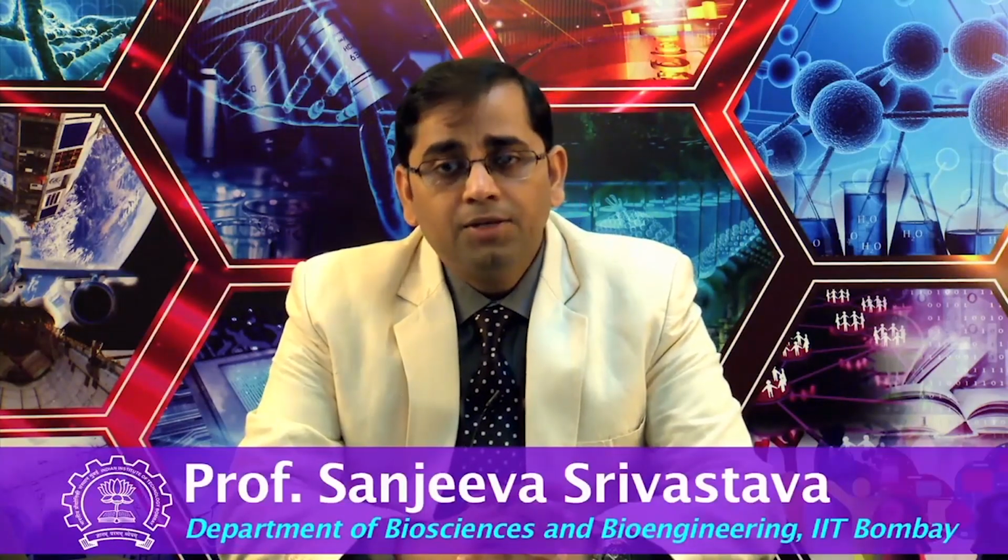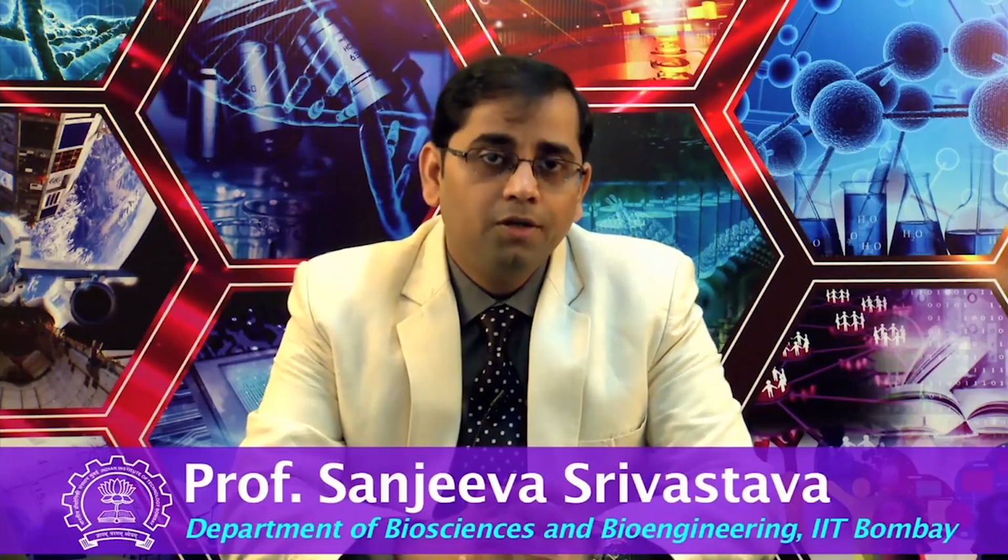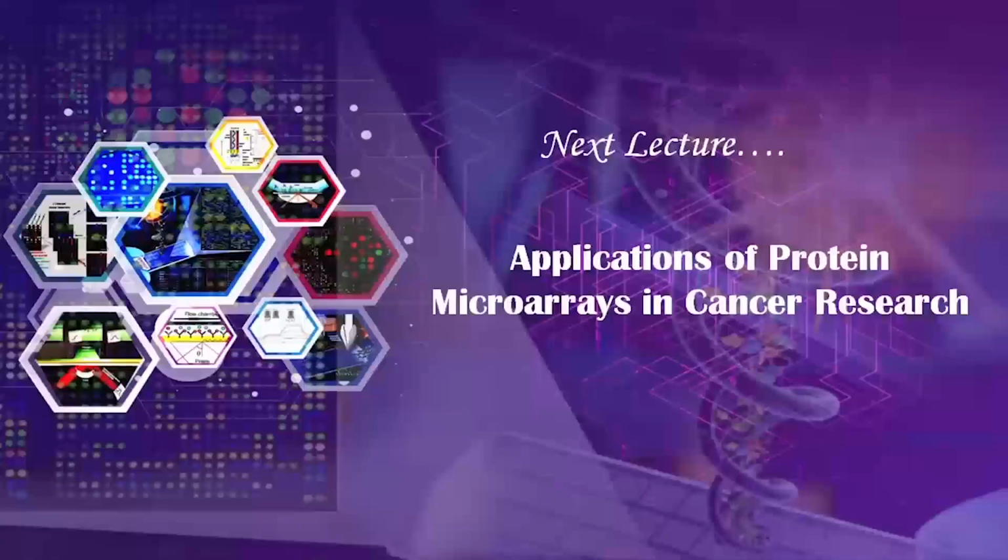If you are doing an experiment where you need only 3 slides, probably even with very minimal variability among the slides, you can still do corrections. But when you have a large number of samples and a large number of microarray slides to perform, then a technology which can deliver high reproducibility in a high throughput manner becomes very, very crucial. In the coming lectures, you will be exposed to more such advanced technologies and their applications in high throughput areas for various types of life science applications, including clinical applications. Thank you.